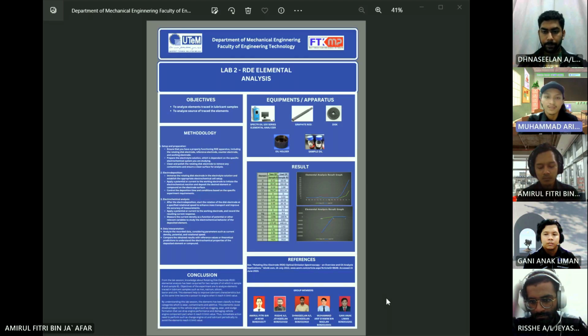In terms of carbon concentration, the new oil sample B exhibits a higher level of 7,925 ppm compared to the used oil sample B1 with 7,514 ppm. This is expected as oil primarily consists of hydrocarbons, indicating that both samples are carbon rich.